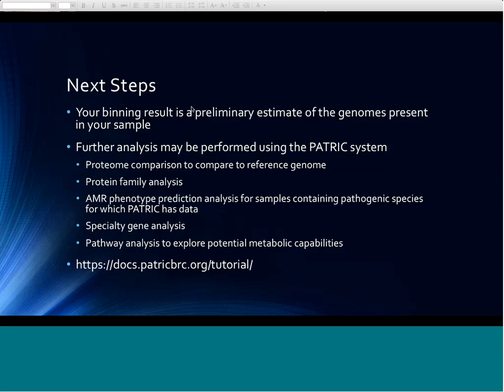Okay. So I've gone through all the questions I believe that were in this list. I just went through them in the order they appeared. If someone didn't see their question answered, please repost it.